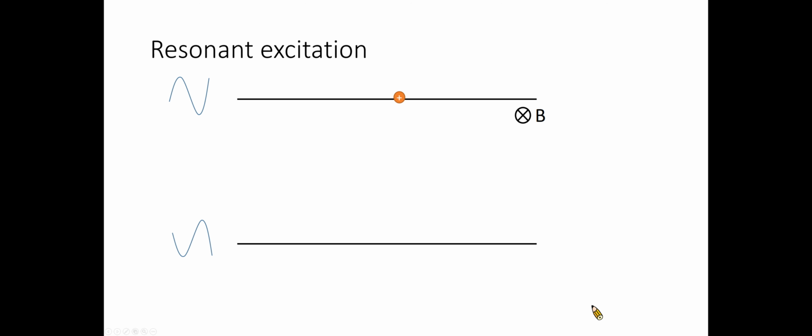In order to improve the ability to detect ions within the analyzer, it is desirable to both increase the cyclotron radius of ions to bring them closer to detection plates and make the ions orbit coherently with one another. Both of these objectives are realized through the use of resonant excitation via electric fields.